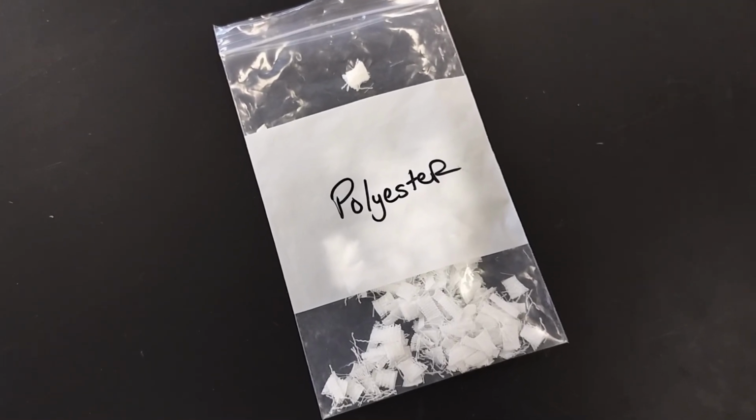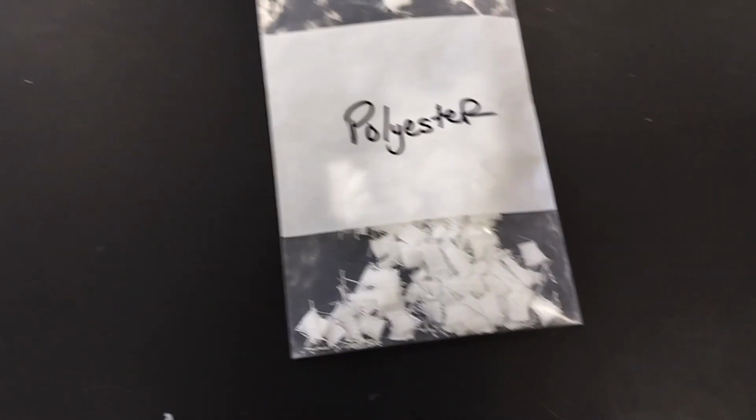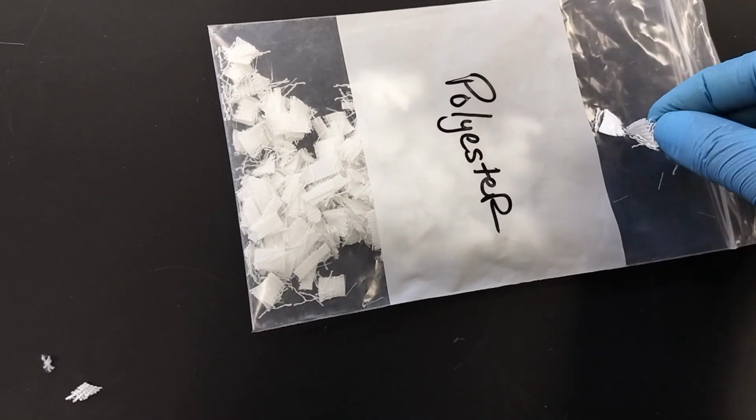So to identify it accurately, we will follow the testing order. At first acetone, then hydrochloric acid, and finally nitric acid.